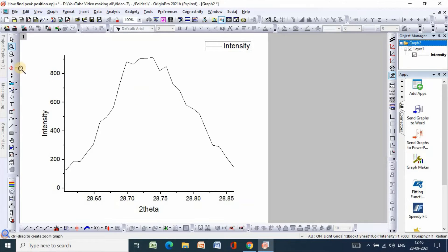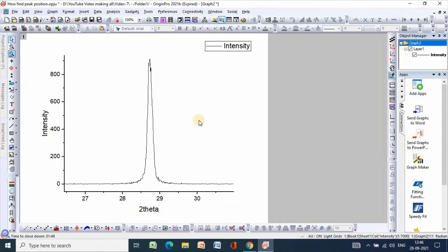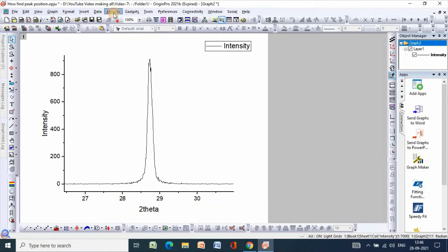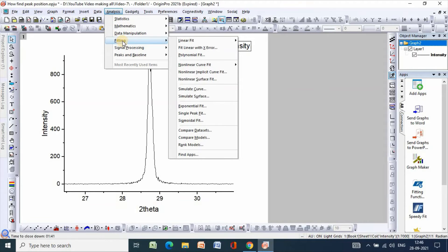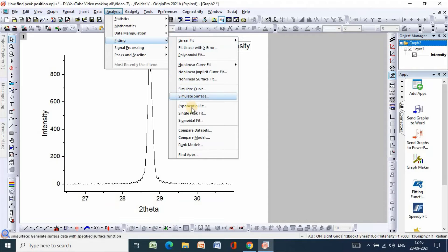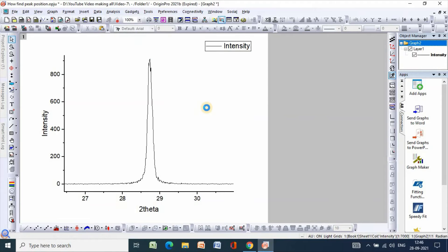You can undo it, then go to analysis, then fitting, then single peak fit.